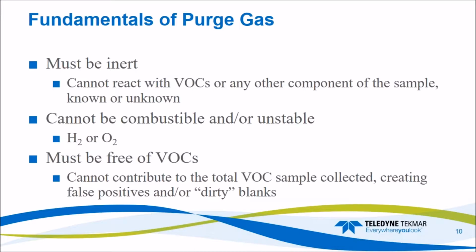But also, a purge gas must be free of VOCs. Usually the standard is 5/9 pure gas, or 0.99999. You don't want to contribute to the total VOCs in your sample collected and create false positives or contaminate your blanks.